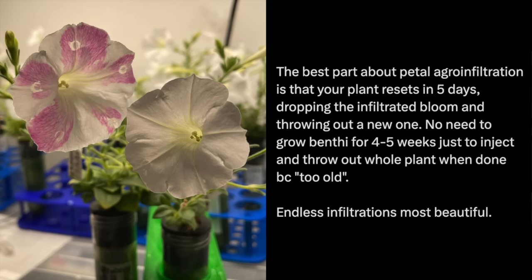Again, this is just temporary to test all the stuff and to make sure that my plasmid isn't toxic, for example, right? Because those petal cells are actually pretty fragile and they're still metabolically active. So if there's something wrong with the genes that I use, like I'm making too much of this one gene or something, it'll just brown out really quick. So it gives me a good indicator as to whether or not I want to commit the next 4 months to something that will probably kill the plants halfway through.